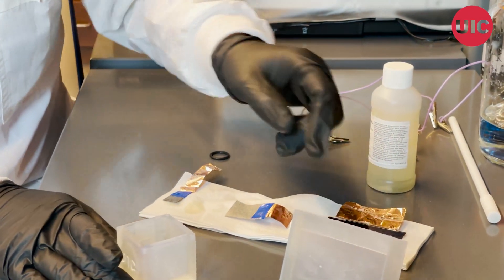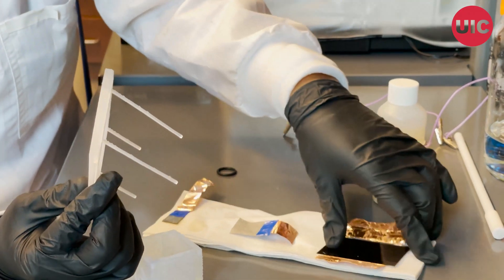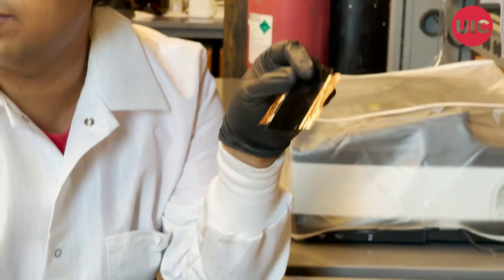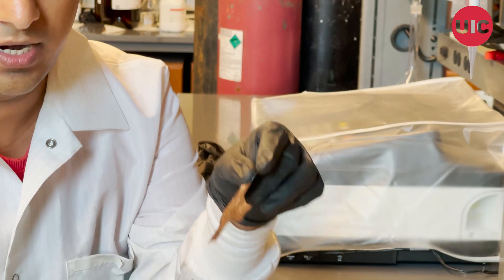First, we'll use this solar panel case and put this triple junction 32% efficient light absorber into it.